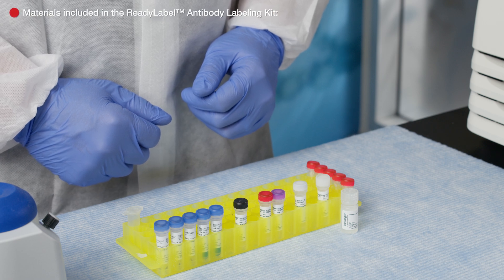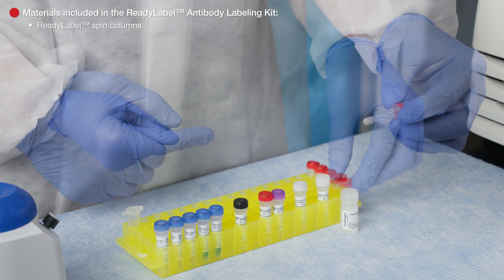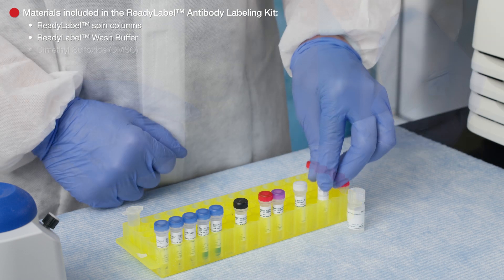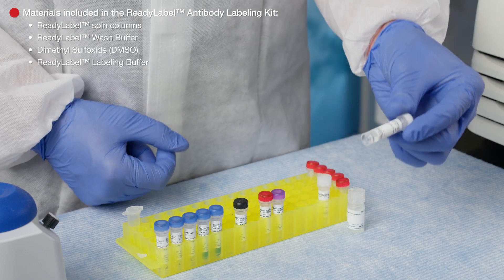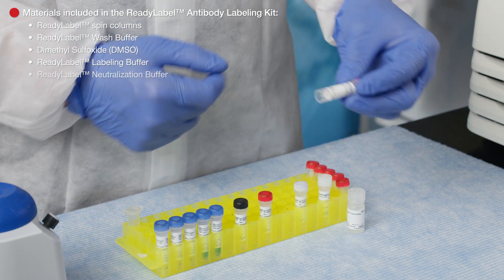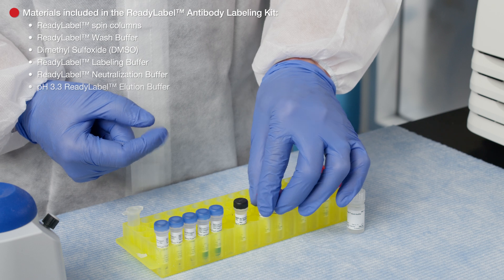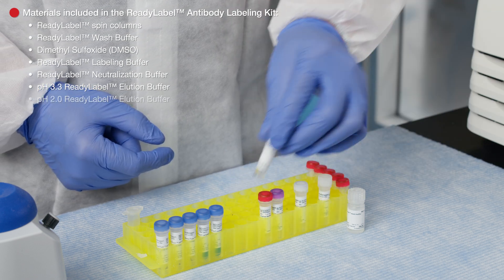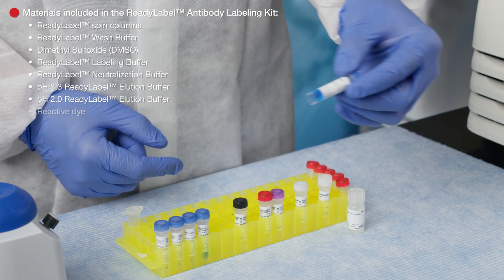The Ready Label Antibody Labeling Kit comes with Ready Label Spin Columns, Ready Label Wash Buffer, Dimethyl Sulfoxide, Ready Label Labeling Buffer, Ready Label Neutralization Buffer, pH 3.3 Ready Label Elution Buffer, pH 2.0 Ready Label Elution Buffer, and 5 vials of Reactive Dye.